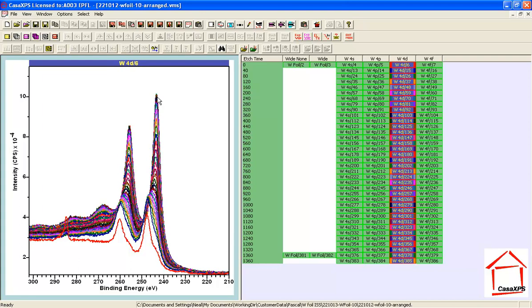After sputtering, the native oxide evolves and progressively changes into a spectrum representative of the metal. The evolution from a native oxide to a metal surface provides a nice example of spectra that are broad doublet peaks, have a degree of complexity involved, and are open to analysis by the techniques I'm going to illustrate. The ultimate goal is to work out a set of component curves representing different phases of the material, giving insight into what happens to this native oxide as it is etched with an ion beam.